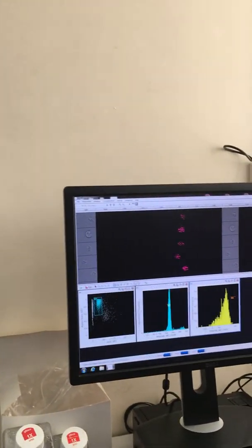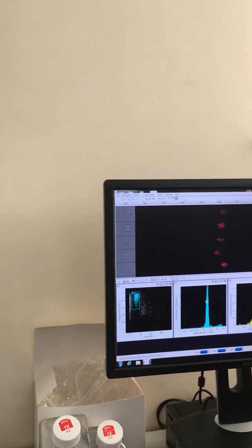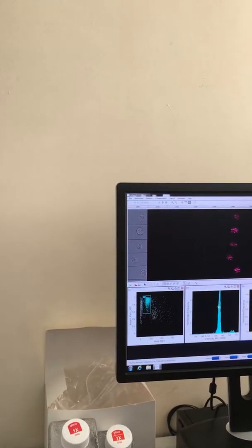So file name, change it to sample, whatever you want. Call it primary or sample.